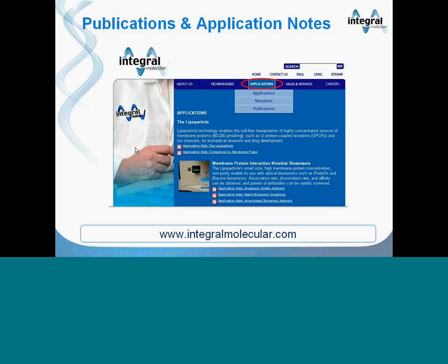Can I ask a question which is related to this? Yes. Do you see the binding of chemokines to the chemokine receptor? No. We've tried. I say no, but we haven't put too much of a concerted effort into that. Okay, so you tried briefly? Right. We tried briefly and it didn't work well. But since that was years ago, it's something we need to come back and revisit.